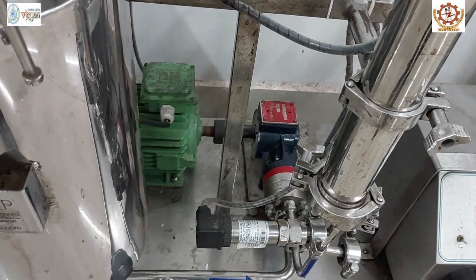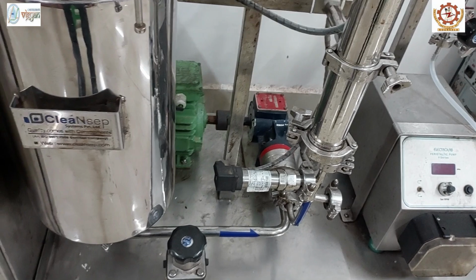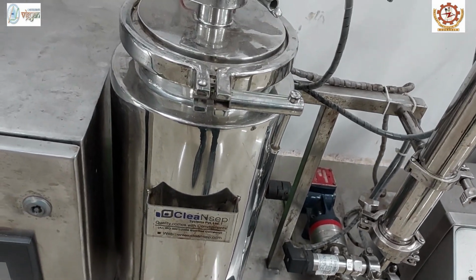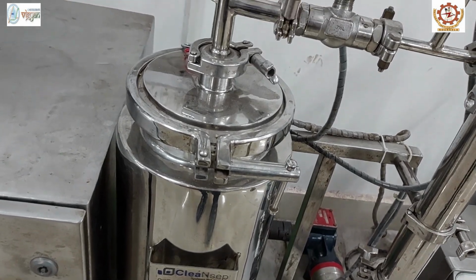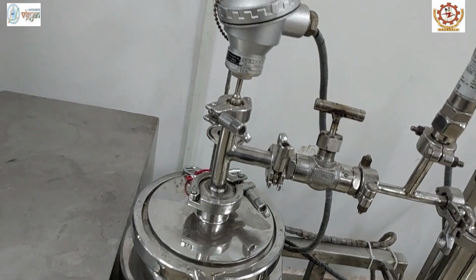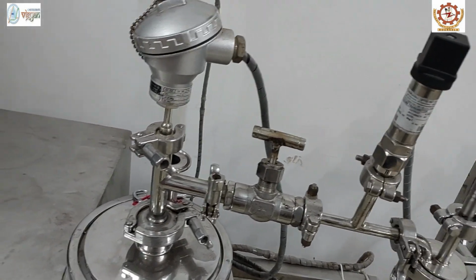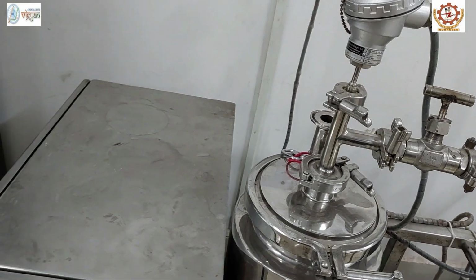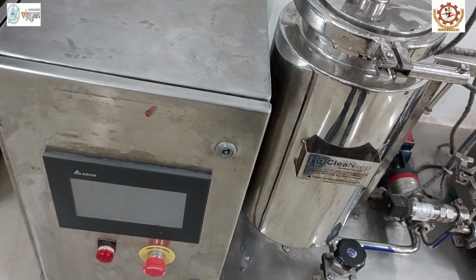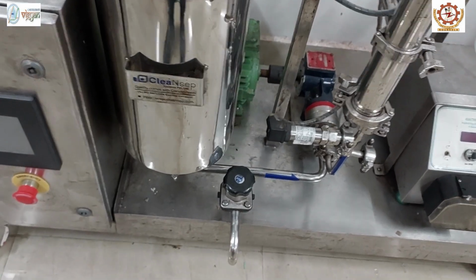In food industries, nanofiltration is used for demineralization of sugars, the concentration of dyes, milk and juices, and recovery of bioactive compounds from liquid foods. It has higher efficiency, reliability, ease of operation, and lower energy consumption than reverse osmosis process.